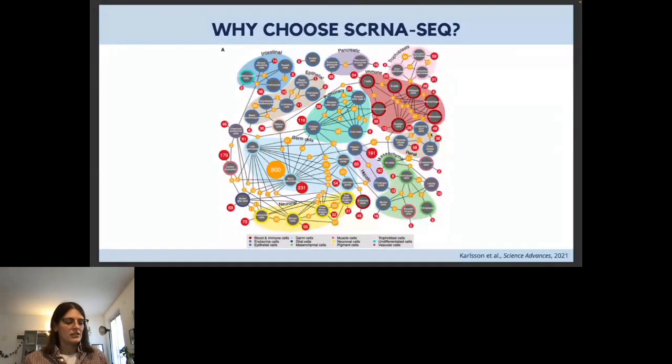We have many expressed genes, and some of these genes are shared among cell types and characterize a group of cells when compared to all others. But in this case, we do not have maybe a physical representation of what it means.